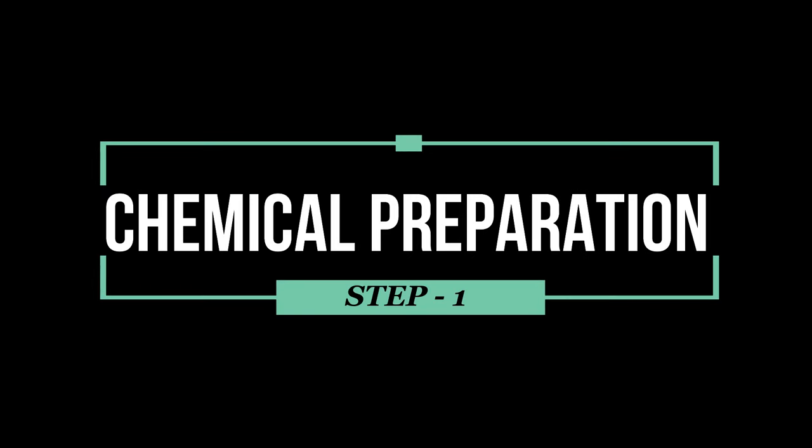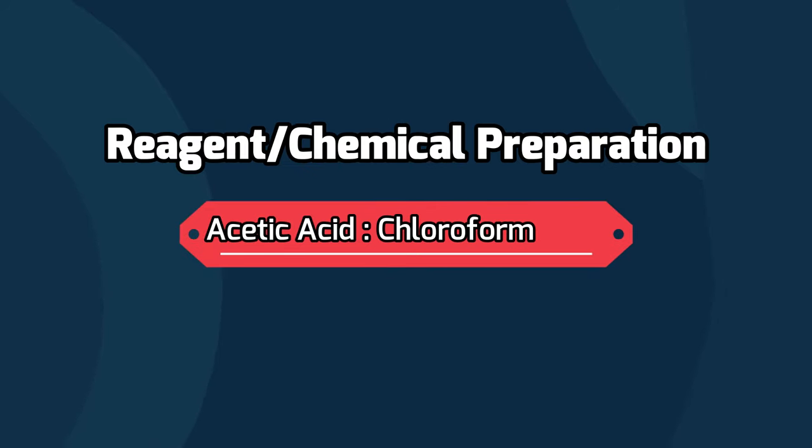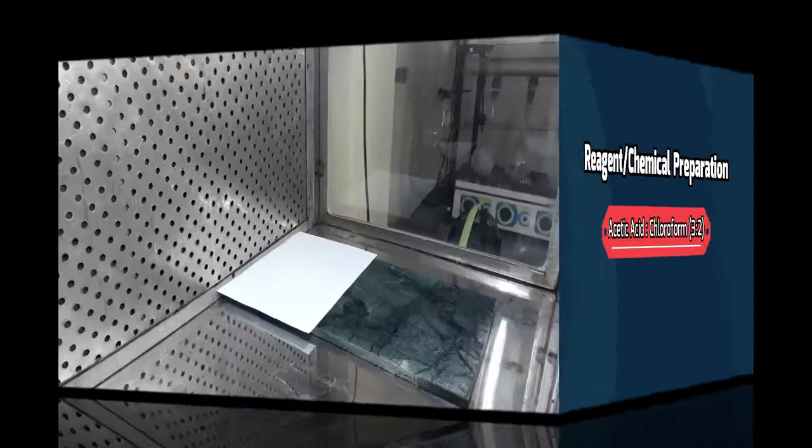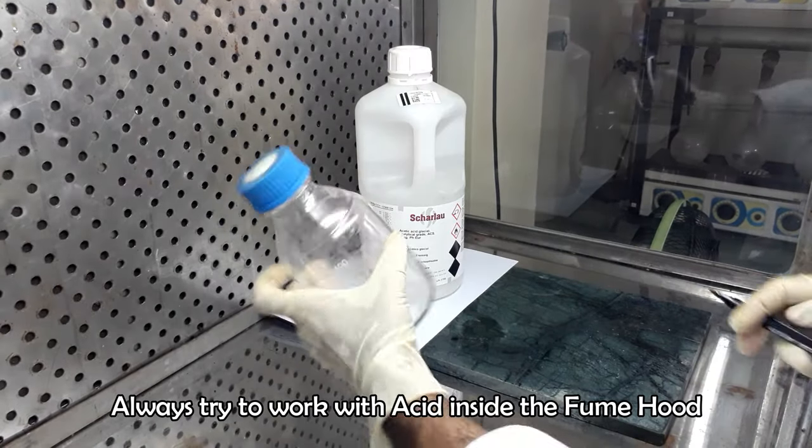Chemical preparation is very crucial for any test. Before going for the main test we will prepare chemicals and reagents. For the preparation of acetic acid and chloroform mixture, first label a reagent bottle.